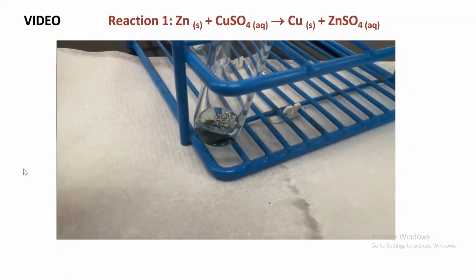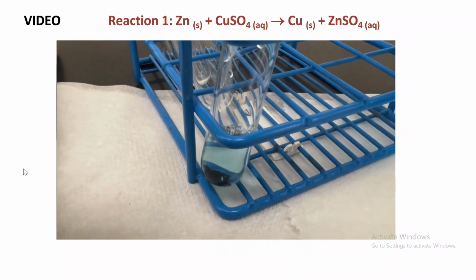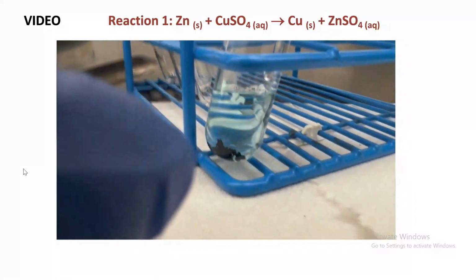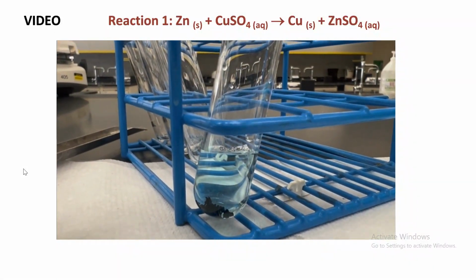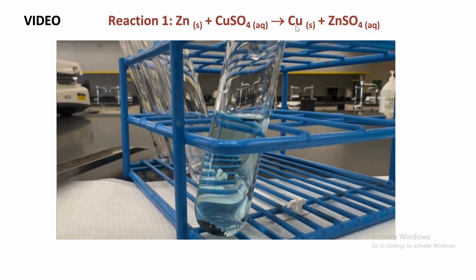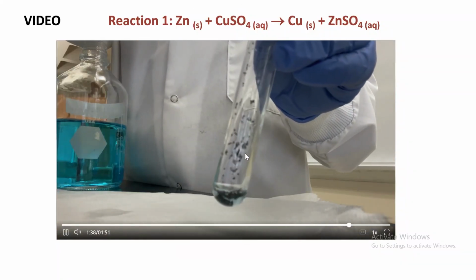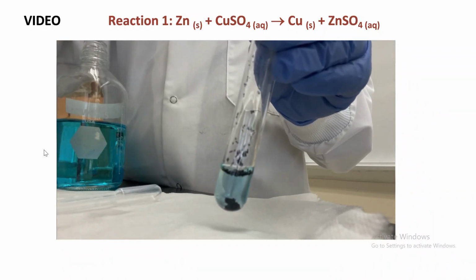Look at that. Do you see it? It's turning black. See that? Or actually the zinc, no more zinc. Well, you see some zinc floating, but zinc now is going to be replaced by copper. So now the zinc is going to take copper's place, and the copper you can see is at the, see, that's the copper that we're talking about. We got a lot of copper now.